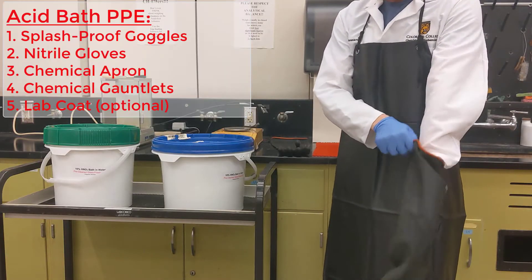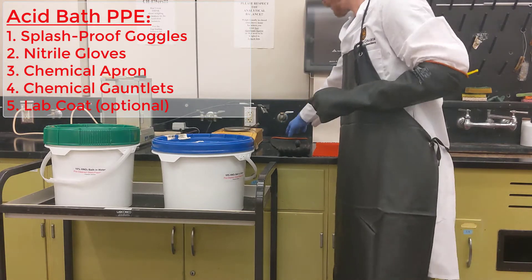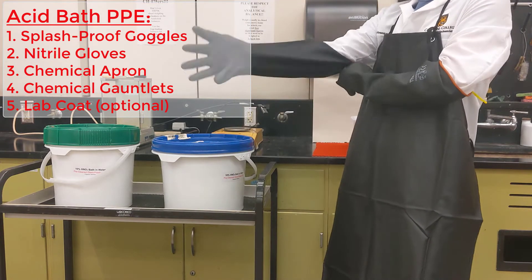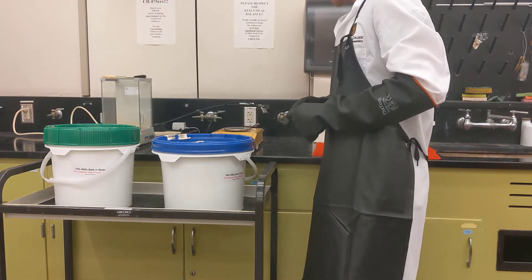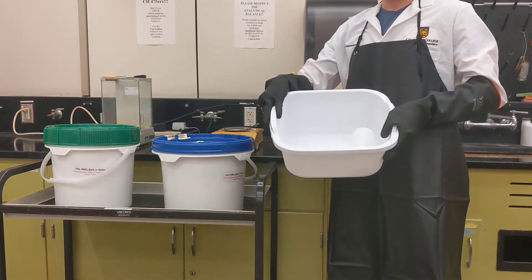The most important thing is to make sure you have the proper PPE when working with this bath. That means first splash-proof goggles — not just regular safety glasses — then gloves, a chemical apron, and the gauntlets. The lab coat is an extra optional layer, useful to protect the clothing underneath.